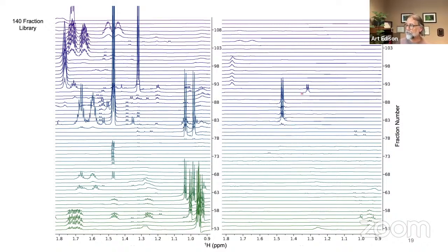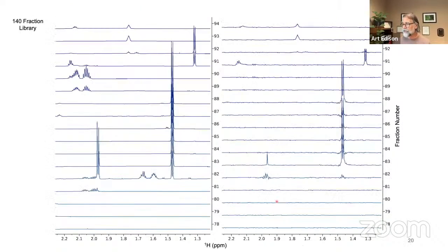So you can see, for example, there's a big binding peak in here, corresponds to here. The stuff next to it that shows up here, they don't bind. The things up here maybe a little weakly, up here they don't. So you can just look and by inspection recognize what regions are binding to this protein. And a lot of these are not FAD species or NAD species. So we realize that this is a way to unravel things that we just didn't know about.